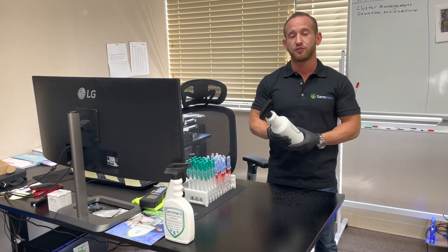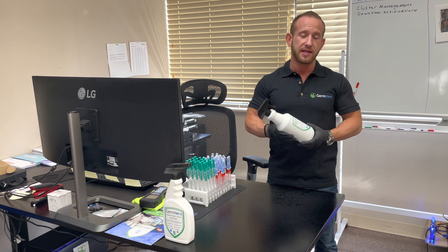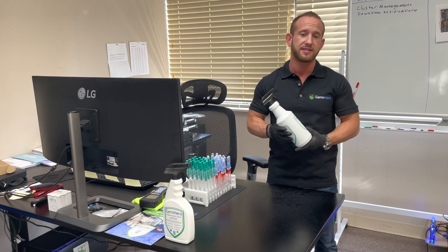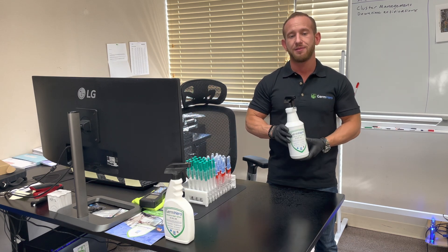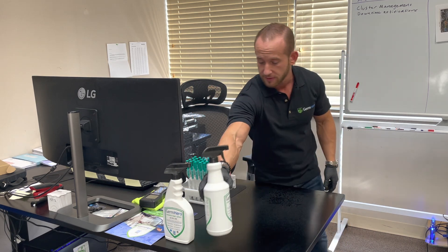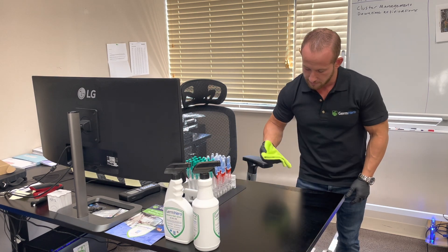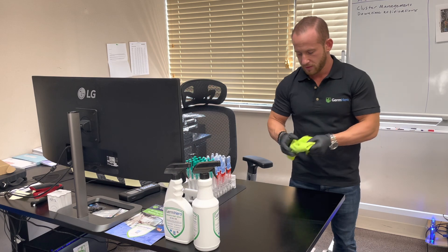It's 100% manufactured right here at Germ Hero. At the end of the day, we're all subject to a lot of marketing — we hear brands like Lysol and Clorox — nothing bad to say about them, but hypochlorous acid is the type of solution that isn't mainstream and isn't commonly sold on shelves. We want to bring this to you and show you just how effective and safe it is. So we're going to spray just a little bit on the surface and give it about 30 seconds to sit, then wipe it and test again.